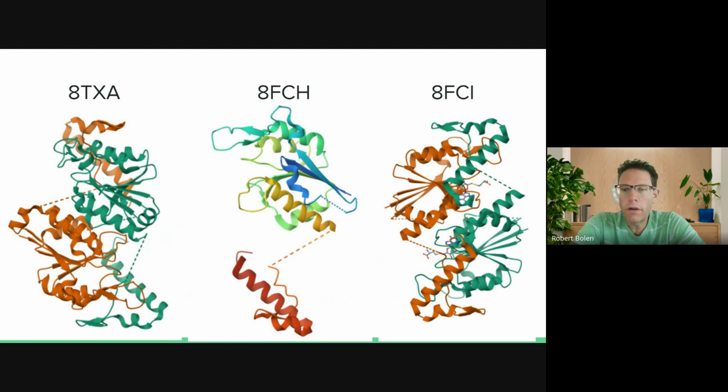And so these have all, again, been structures of proteins. These are structures that were resolved by students, and they were crystallized by students and collected by students. So this is the type of thing that you'll be doing moving forward at the Beamline. And again, what's important is to understand that the crystals need to be in as pristine a condition as possible. We want the most ideal structure to the crystals so that when we shoot them with the X-rays, we can get the most precise structure out of them. The better the crystal, the better the structure we're going to get. And that's what was mentioned in the little video that we had there.